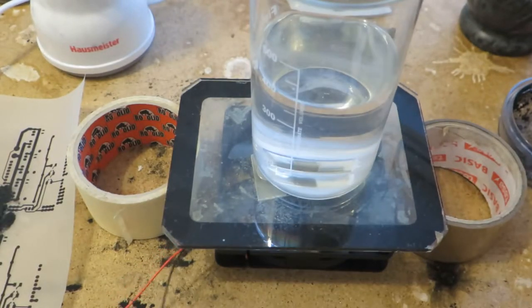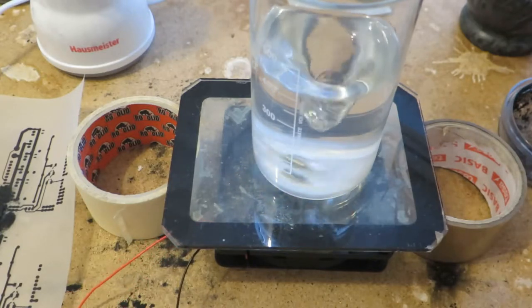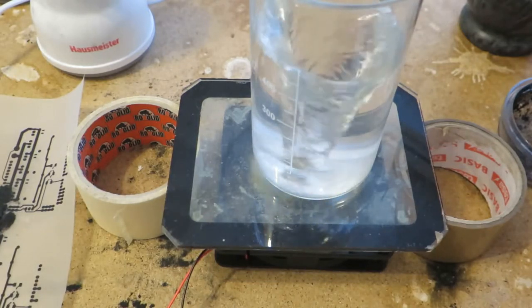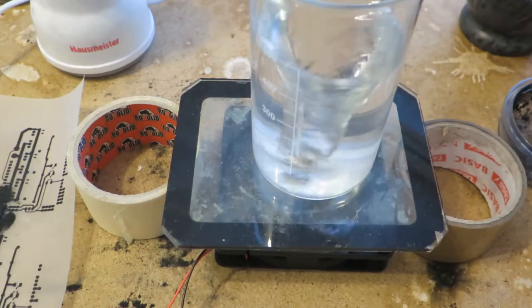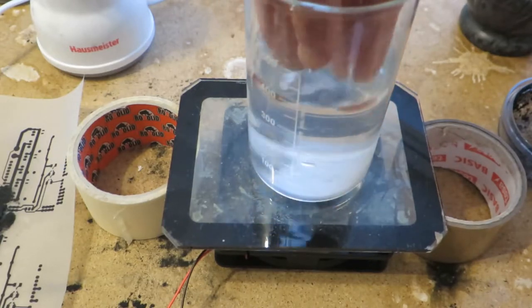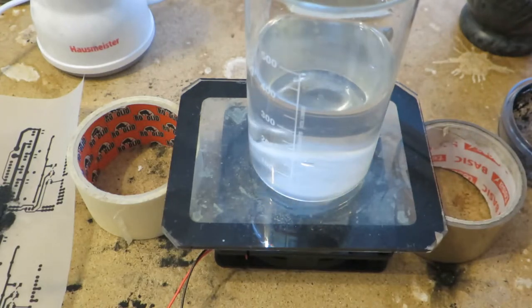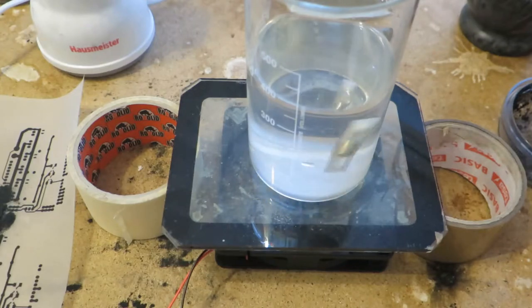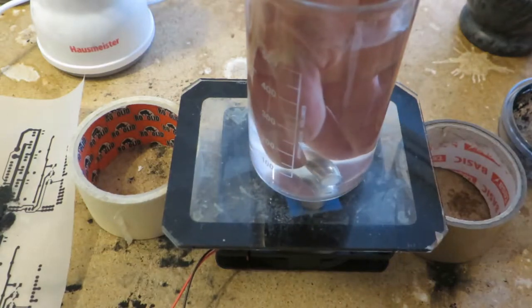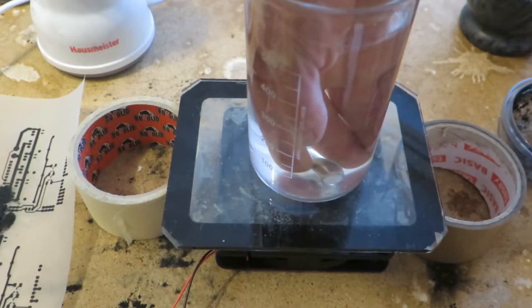So I am powering this fan with 5V. And you can see that the stirring is quite strong. I can stop this by hand and it will go out of sync and it won't stir anymore. I can turn the motor with the stir bar. Let's see if it will spin up when I am blocking the stir bar. Absolutely.